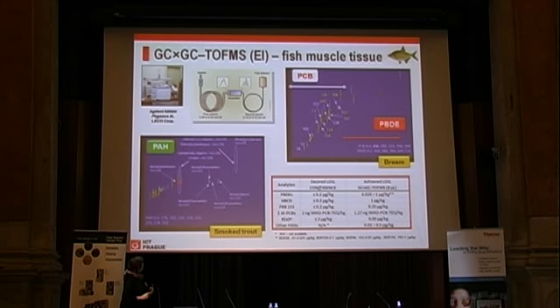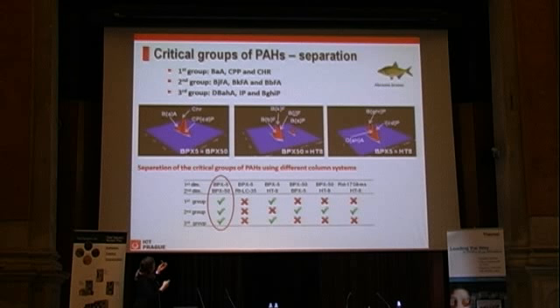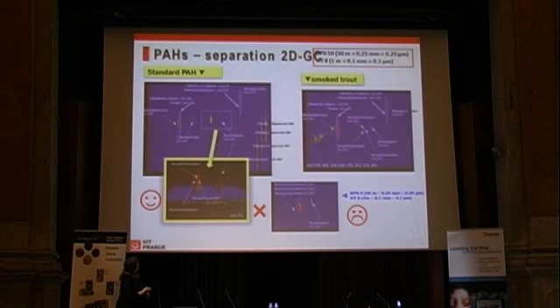Okay, and I will not go into the details, but still, it is always difficult because when you combine the columns, one pair is separated, the other one not anymore. So this was the PhD student's work he spent. Okay, and again at the end, some demonstration of certified reference material which shows you that your work is valid.